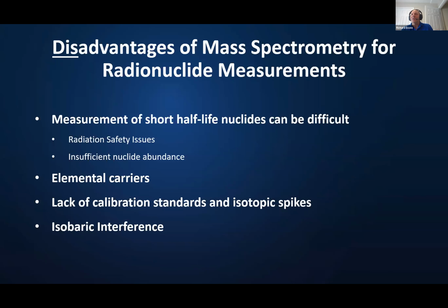How does that factor into the traceability of a measurement? And again, I think this is foreshadowing a discussion that might be in more detail tomorrow. But these are some of the issues that we've run into, because for uranium and plutonium, they make synthetic calibration mixes where you can use gravimetry to essentially mix isotopes. But there's an awful lot of elements where that can't or hasn't been done yet. So you're stuck using assumed natural compositions for calibrations.